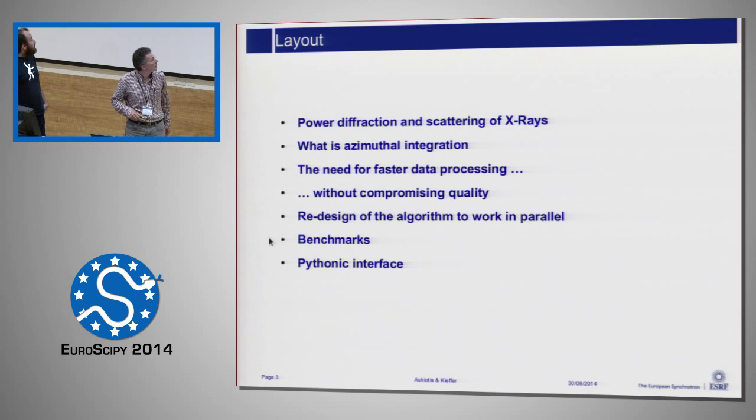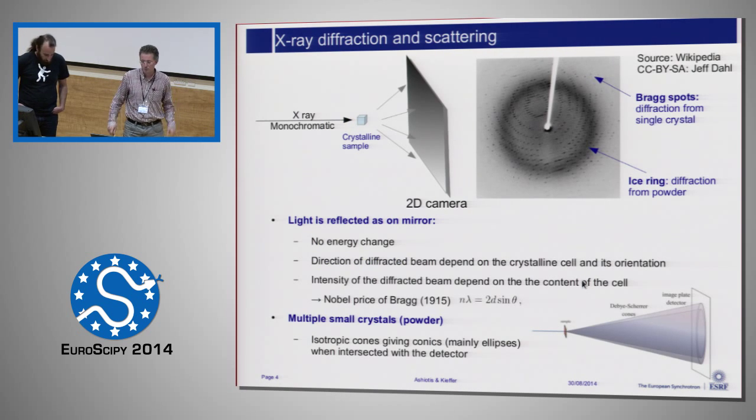So I will start by introducing what X-ray diffraction is, and then we will go more on the computing side that may be interesting for most of you. We'll show some benchmarks, and I will expose the Pythonic interface at the very end.